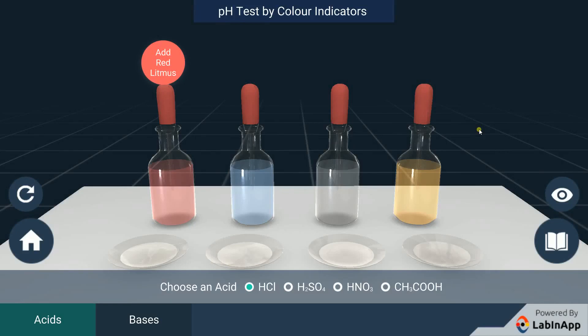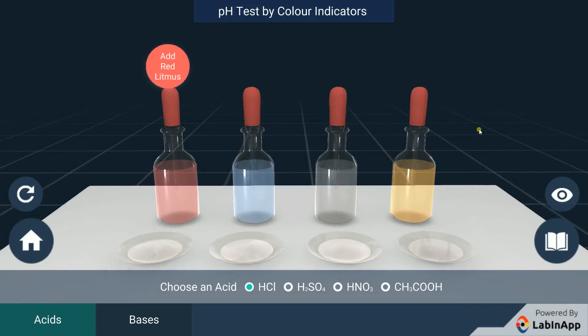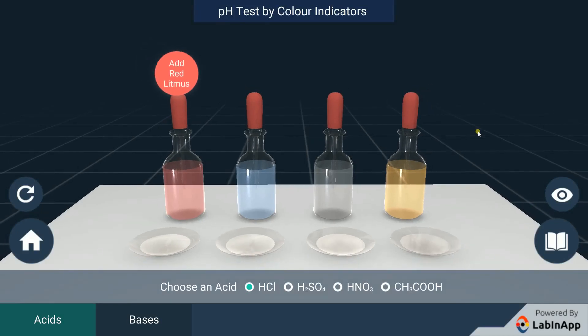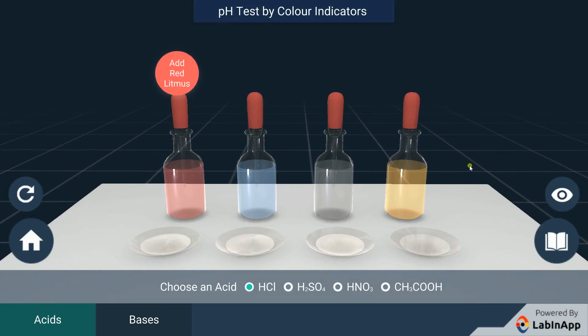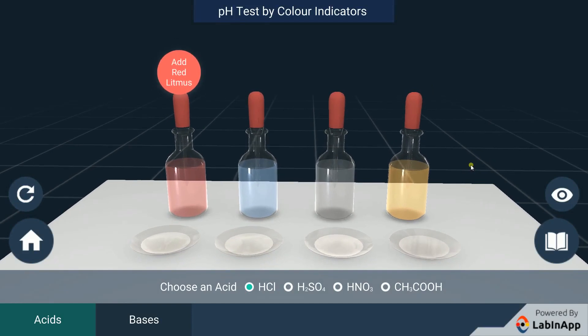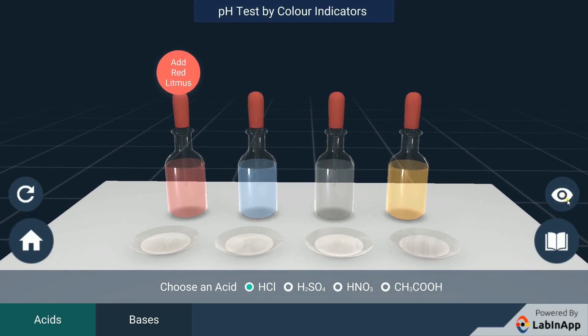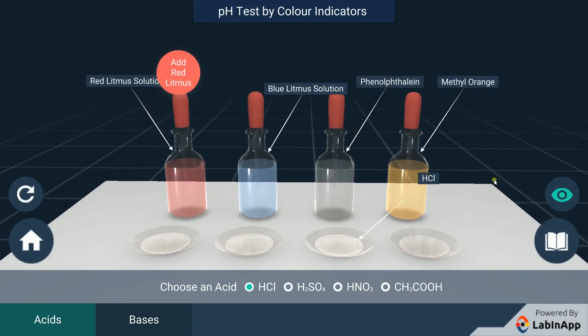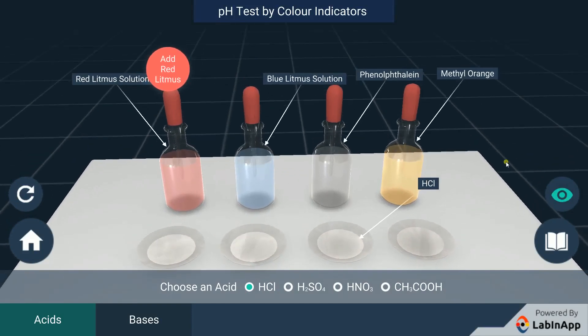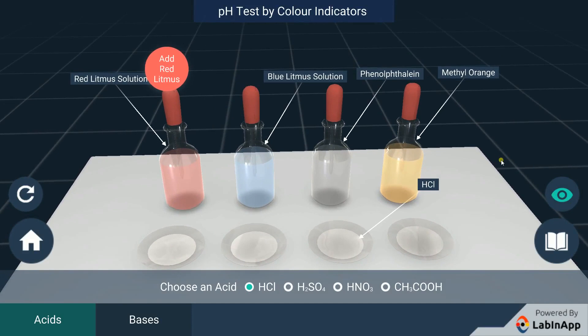Let's study how to identify acids and bases using red litmus solution, blue litmus solution, phenolphthalein and methyl orange indicators.